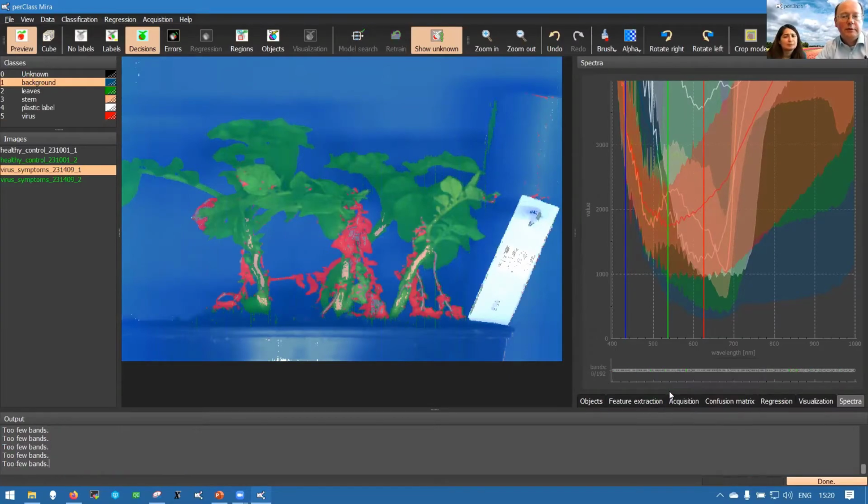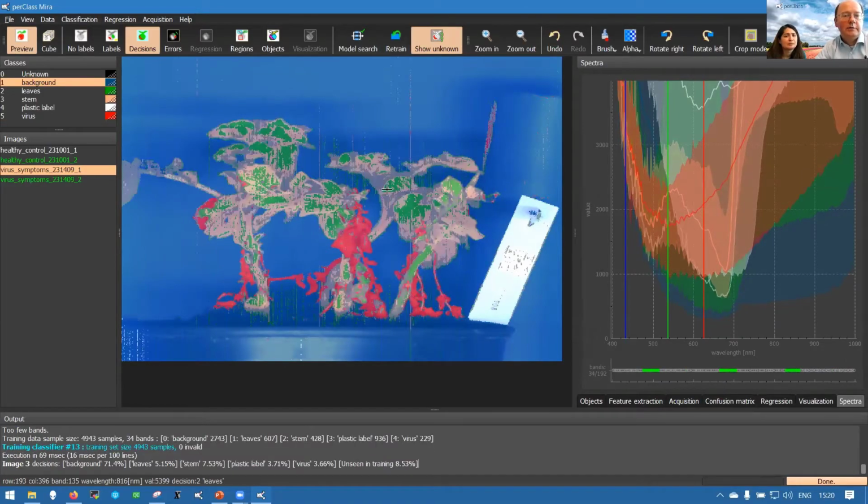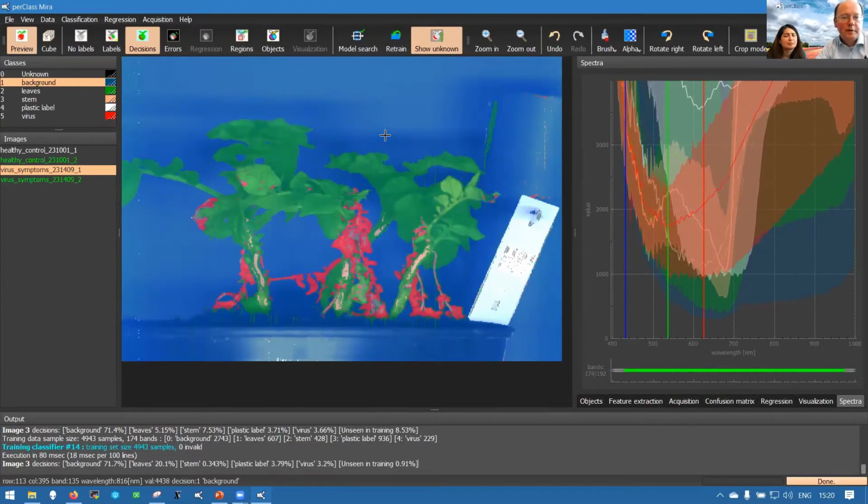You may also remove everything and define very specific ranges. In this way, you can find out when things break and what information you actually really need for the classification. This helps when you want to decide which sensor you want to use, which range of spectra is more informative.